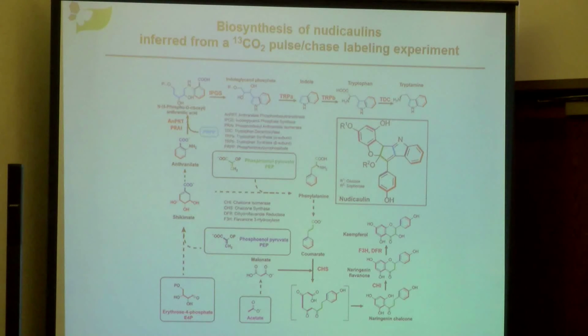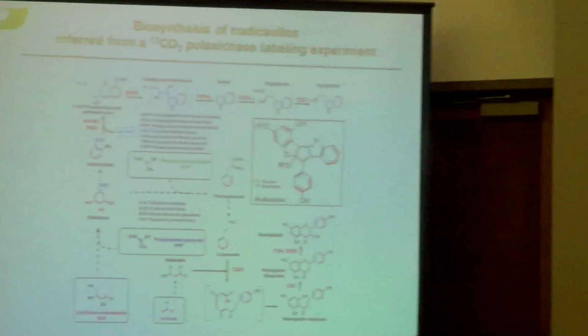So to summarize, what I have been telling you is that we are using analytical methods in chemical ecology to identify new compounds, to quantify compounds, to do analysis in terms of metabolomics, metabolic profiling, and also to localize some natural products in a cell-specific manner and investigate their formation through their biosynthesis.